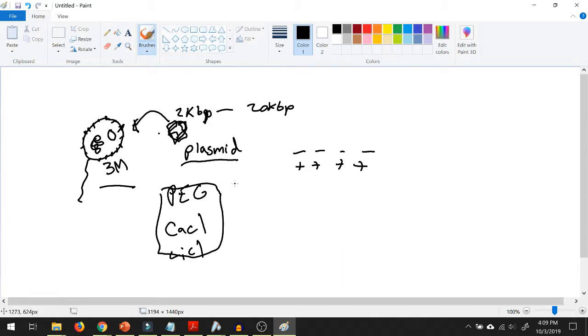All right. So the transformations that you're going to do are very similar. What you're going to do is mix some bacteria. The fresher the bacteria, the better. The fresher the organism, right? The organism's healthy, it's going to be robust, it's going to keep growing. So fresh bacteria, and mix it with the bacterial transformation mix, and mix it with some plasmid DNA, and hopefully at the end you get a GMO, right?